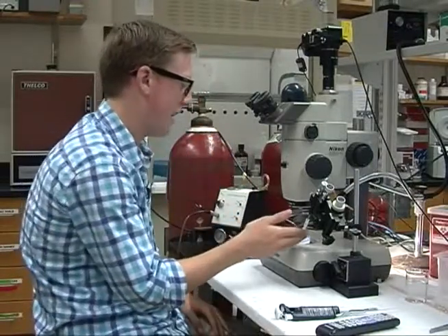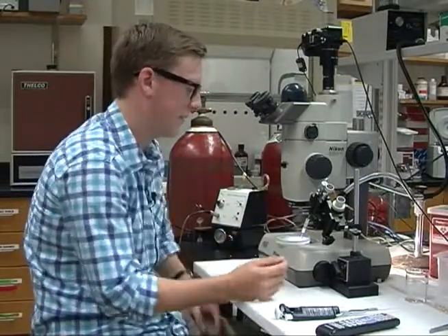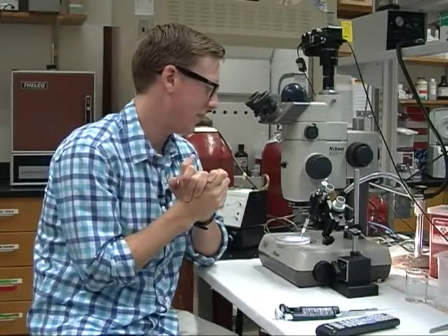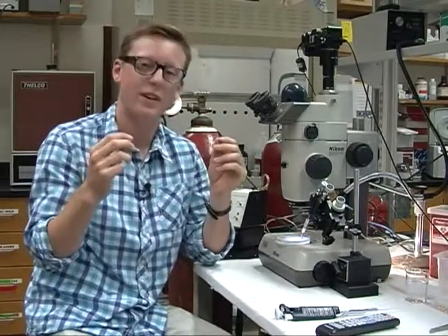The first step of the process of this experiment is injecting the embryos with Morpholino oligonucleotide. MO is a chemical that we use to knock down gene expression, and we're specifically knocking down the gene of interest, which is anoctamin 1. So we pulled a microelectrode. It's a very, very small glass tube, which I will show later how we actually pull it. And it pulls the tube into a very, very fine tip.